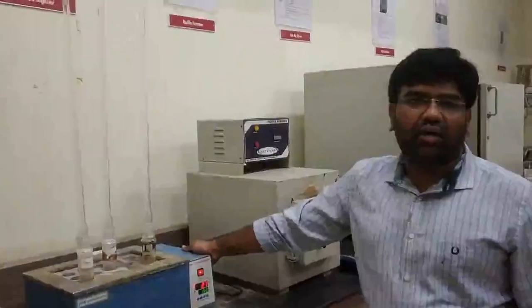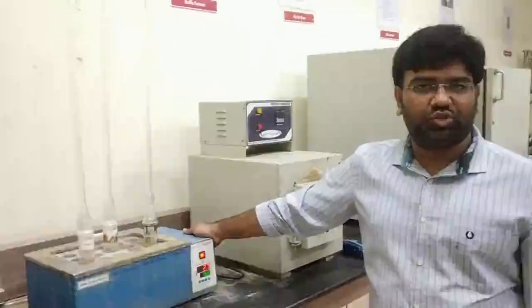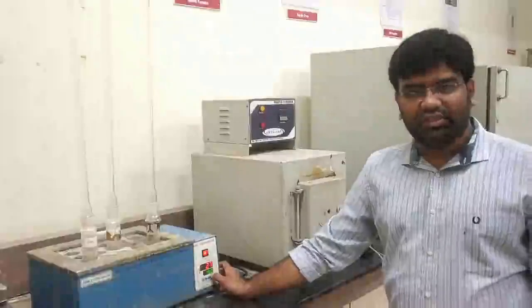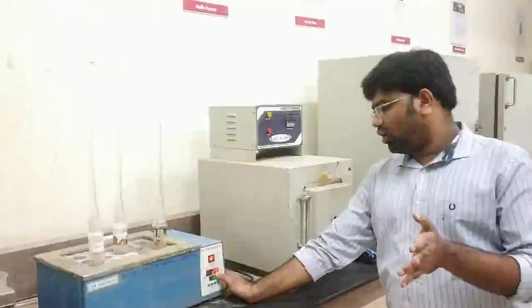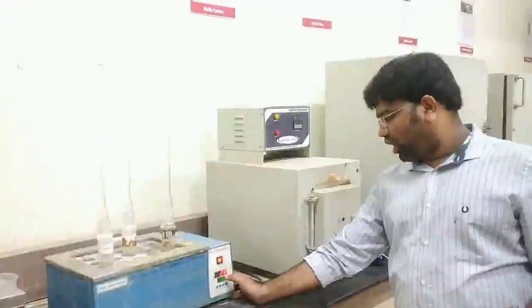Here the entire accelerated thermal digestion or oxidation process is going to happen. We have set the temperature to 150 degrees Celsius, and this is the current temperature. We have to keep this for 1.5 hours at 150 degrees Celsius.